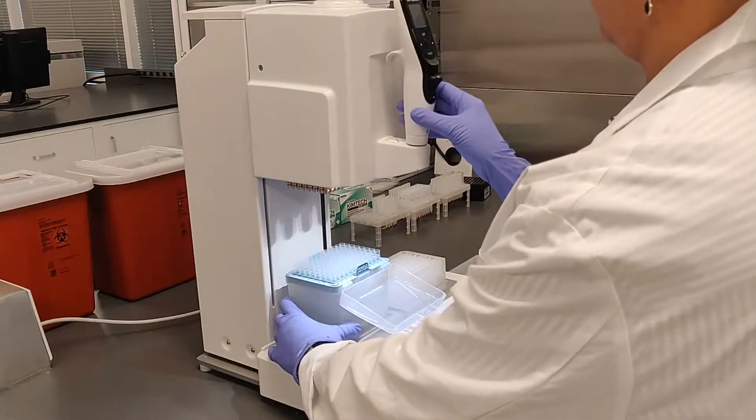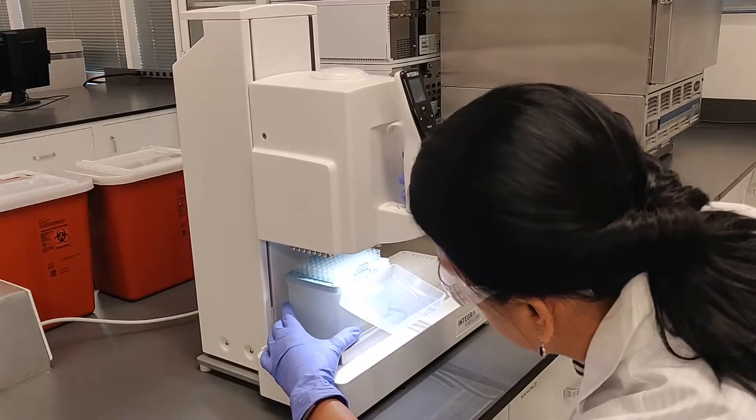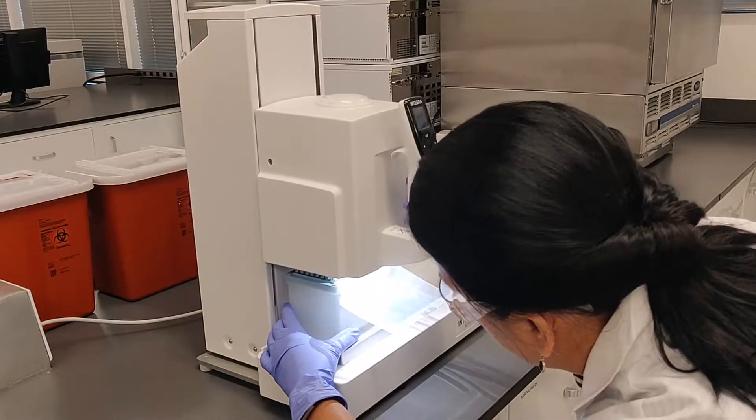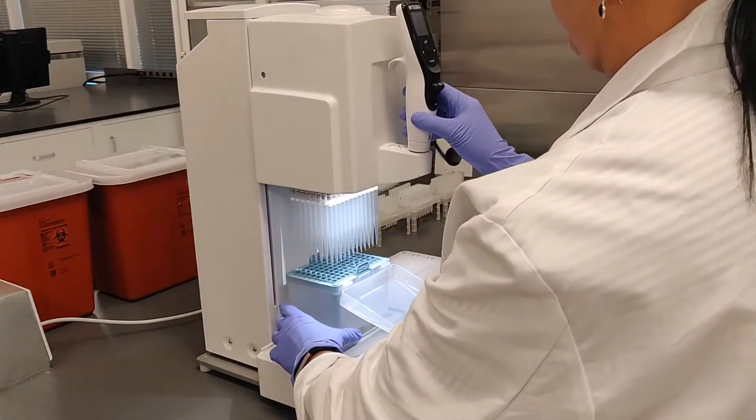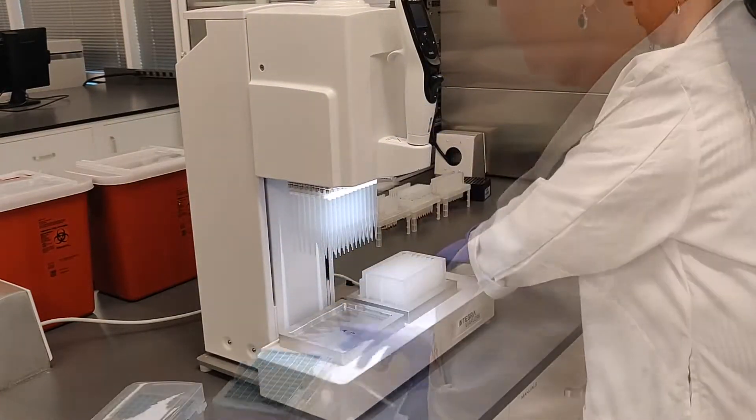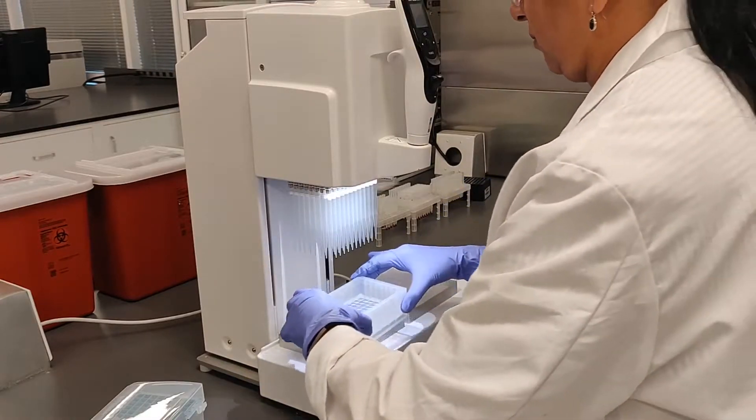During the extraction process, you can prepare a 96-well collection plate manually if you want, but it's 75% faster and a lot more convenient when you use the Integra ViaFlow 96-well pipetting robot.